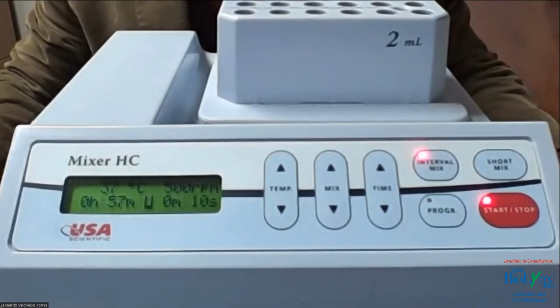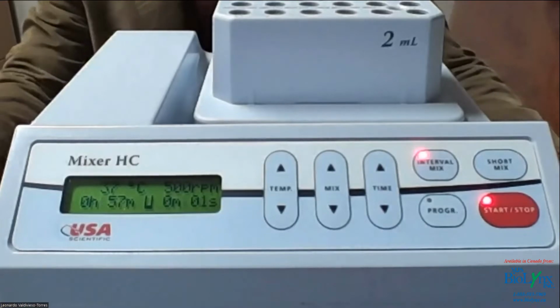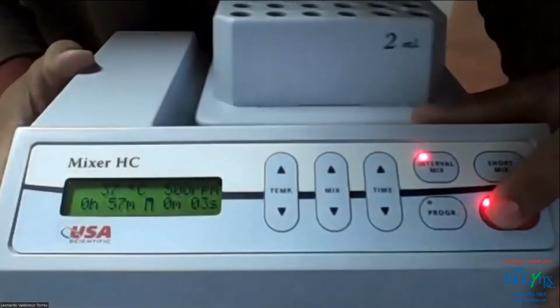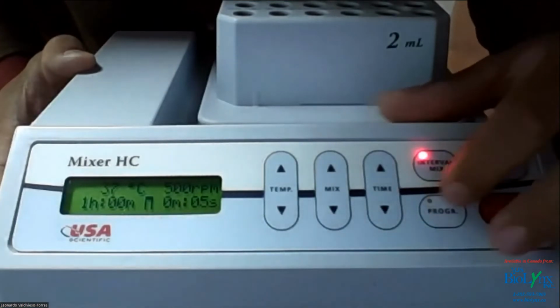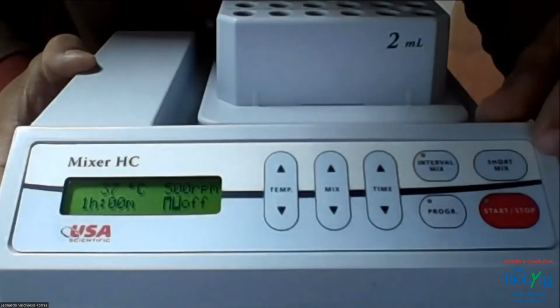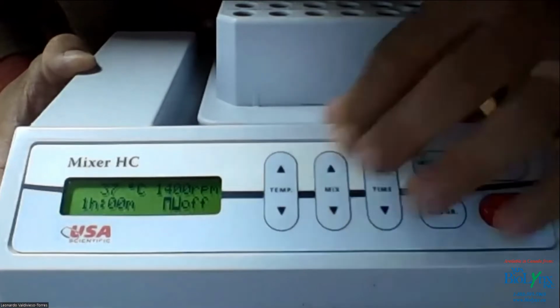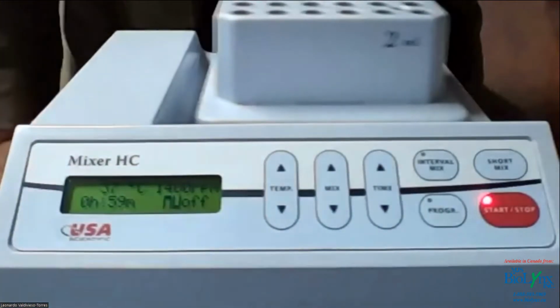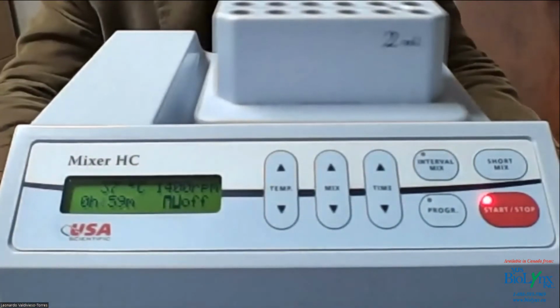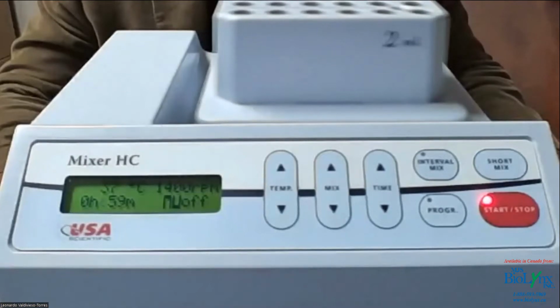Okay, we have one here, Leonardo. How do you adjust the Vortex speed, and could you please demonstrate the highest speed with this block? With this particular block, it recognizes which block is in. I'm gonna turn on the function, and I'm just gonna do mixing. So that's 1400 RPM. Let's see. Can you see it mixing? Yeah, that's looking good. 1400. Yeah, it looks pretty good.